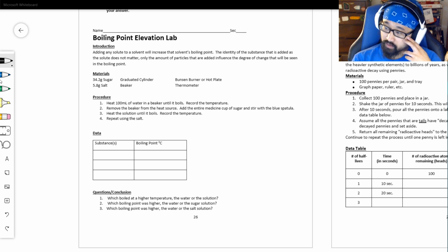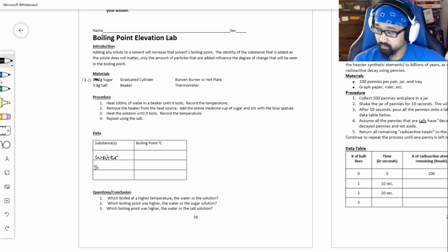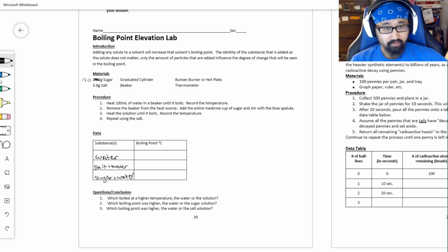So one thing that I noticed, this is not right. This is the wrong amount of sugar. I shouldn't have erased all of that. It's not 34.2. It's actually 18 grams of sugar, and there's a reason for that. The three substances that we heated in the lab were pure water, salt and water, and sugar and water, which shouldn't surprise anybody. When we did this in class, most people got a boiling point for water right around where it should be, which was 100 degrees Celsius.